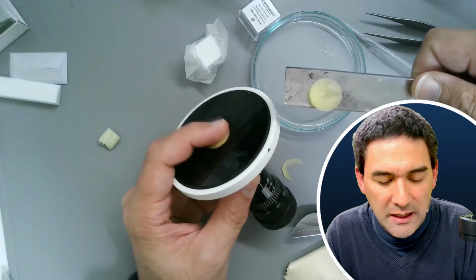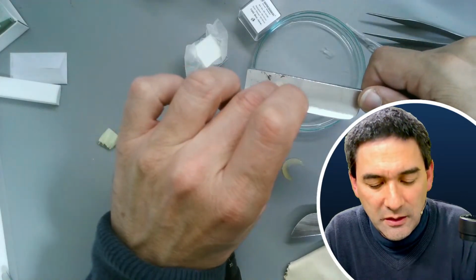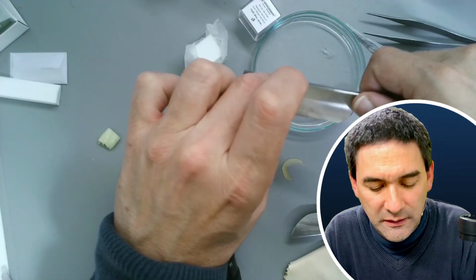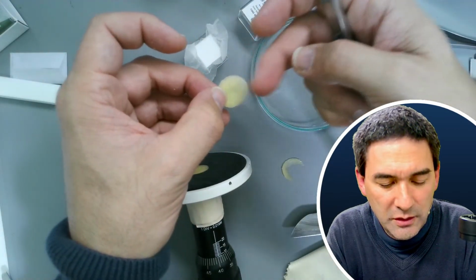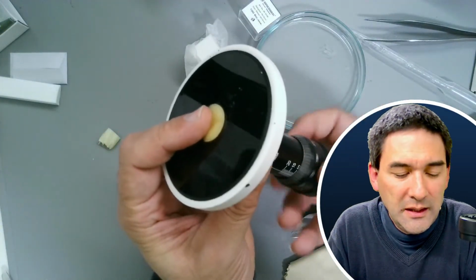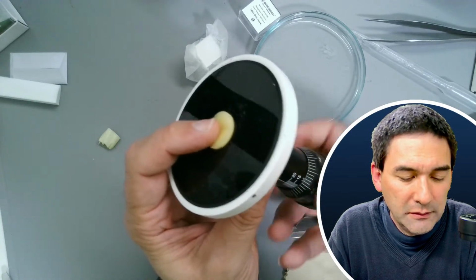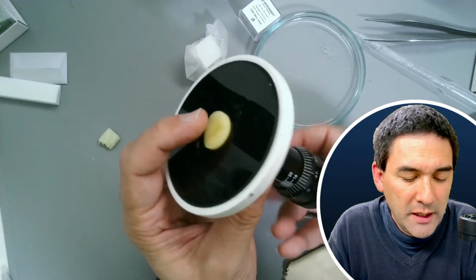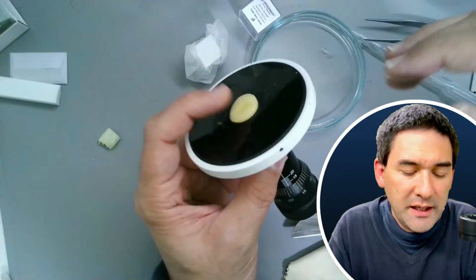Very thick, and because I lifted my finger, it's too thick on the side here, right? It's okay over here, but still not satisfactory. But I think you get the idea of the problem that I'm having here. So what I'm going to try now, see, I have to lift it out that far until it becomes flush here on the side.